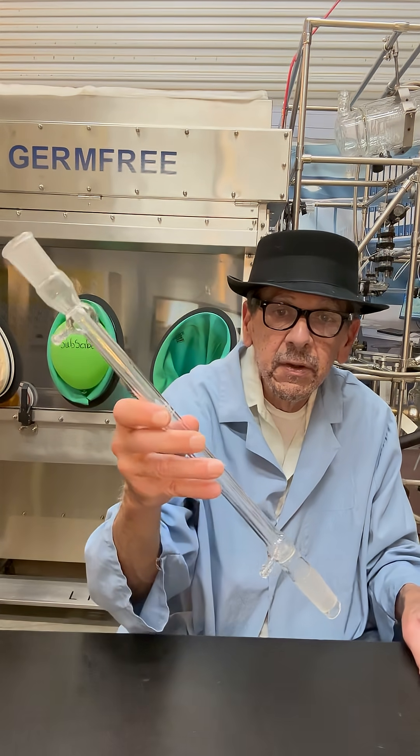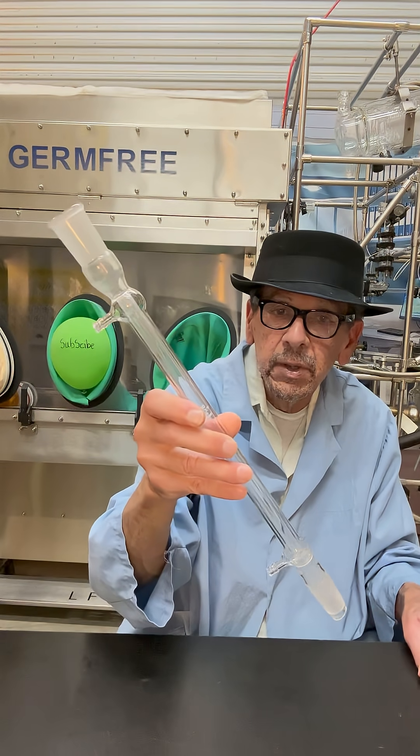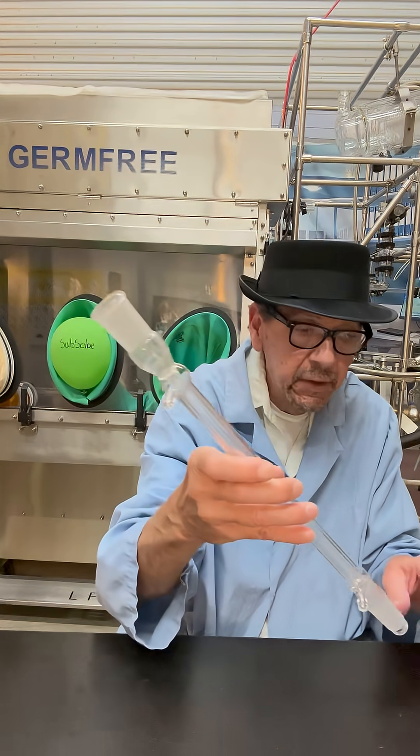This here is a Liebig condenser with a straight tube and a water jacket part.